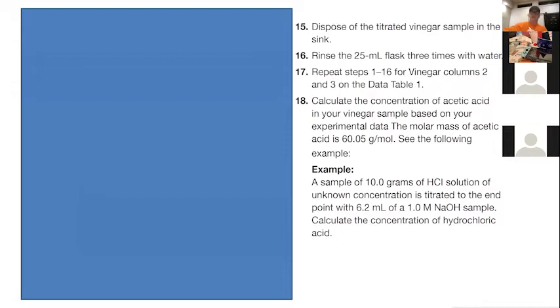So here, when we calculate the concentration, let's say we calculate a concentration of 0.800 molar acetic acid.